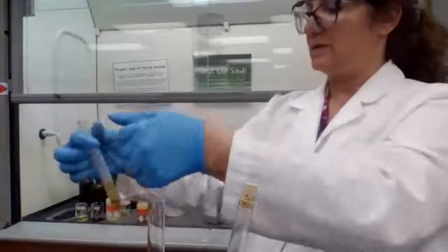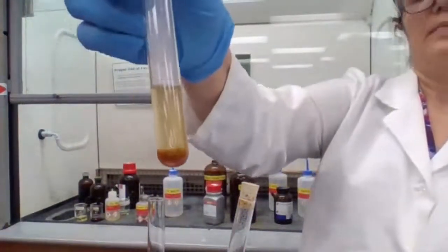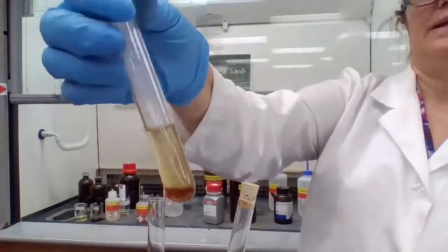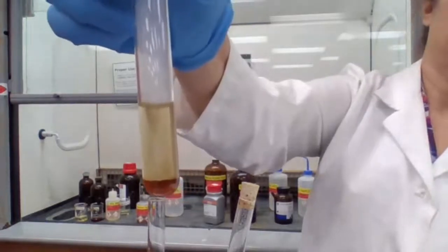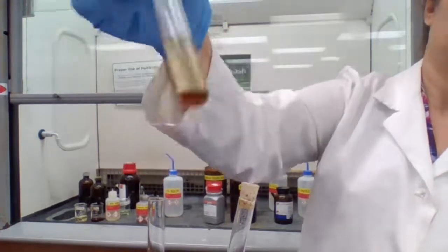It doesn't go in solution. Okay, that's what's happening, right? It doesn't go in solution and you have two layers now. Okay.